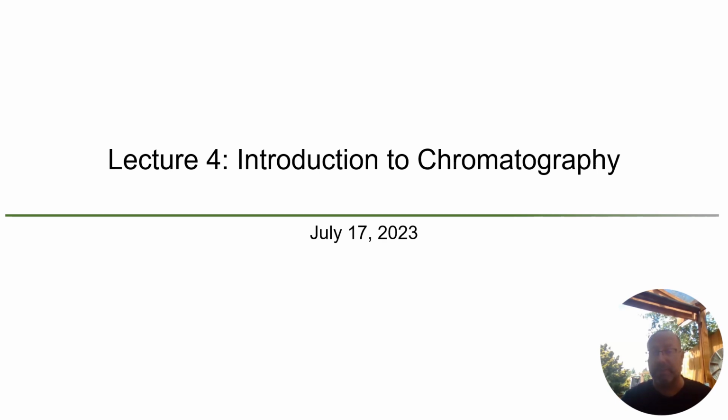Today we're going to go over an introduction to chromatography and the fundamentals of chromatography. I'm trying to keep these slides down to 10 to 12 slides a unit so that it doesn't get too confusing.